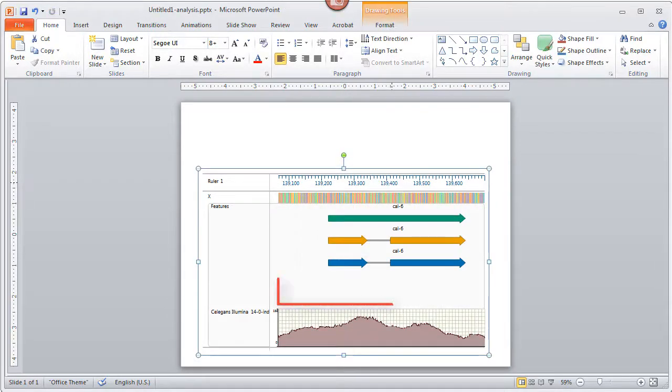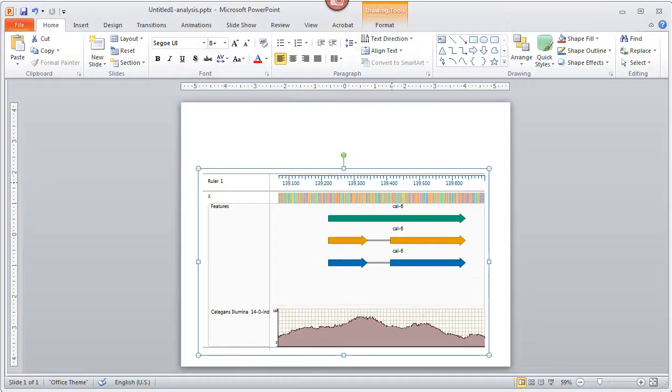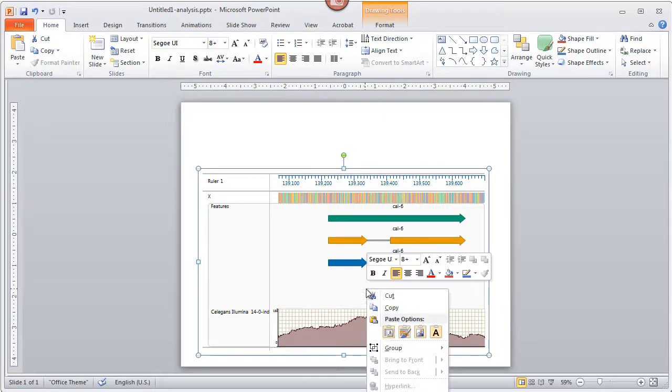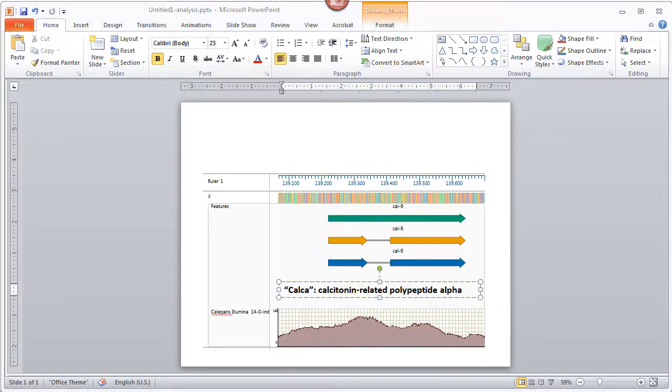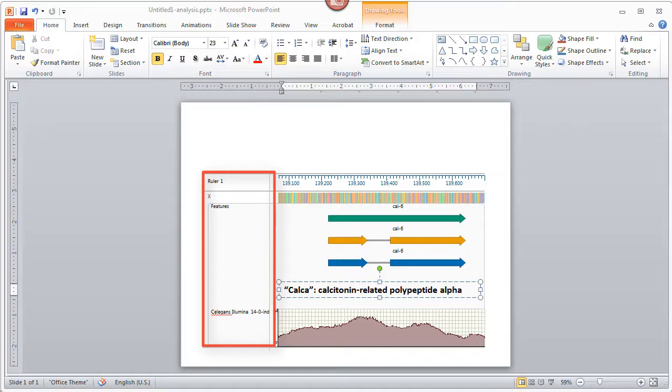In the white space that I added earlier, I'm going to paste some descriptive text from my clipboard. The text on the left was exported directly from GenVision Pro. Just like any other text in PowerPoint, these individual text boxes can be moved, edited, reformatted, or deleted as desired.